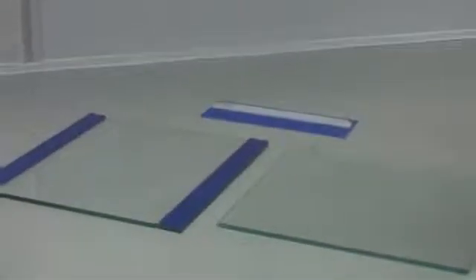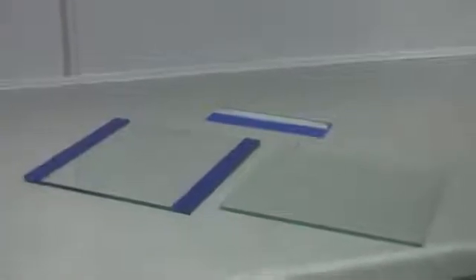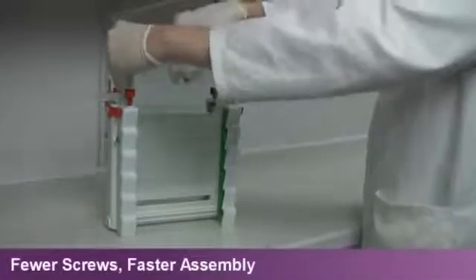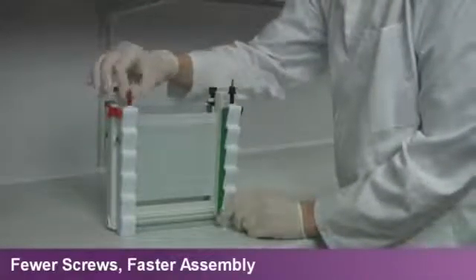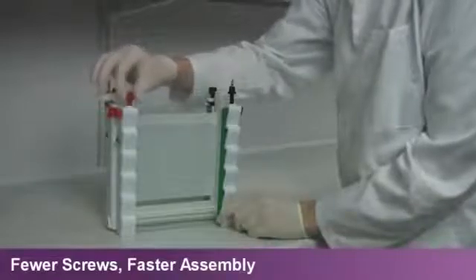Color-coded combs and spacers allow the user to select their gel thickness and sample throughput. A dual-purpose page insert with an ergonomic wave-like design for easy handling eliminates time-consuming transfer of fragile gels between separate casting and running modules.